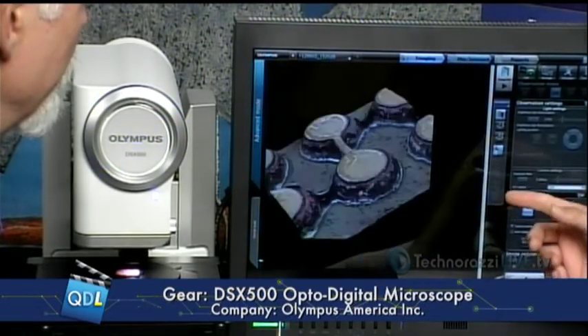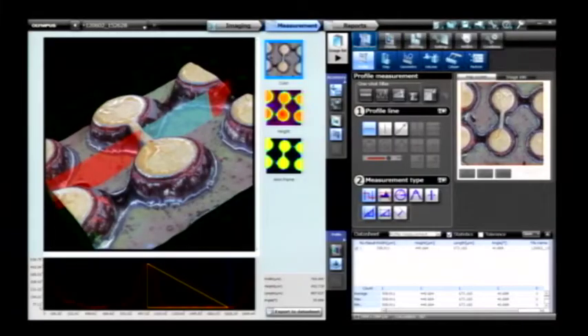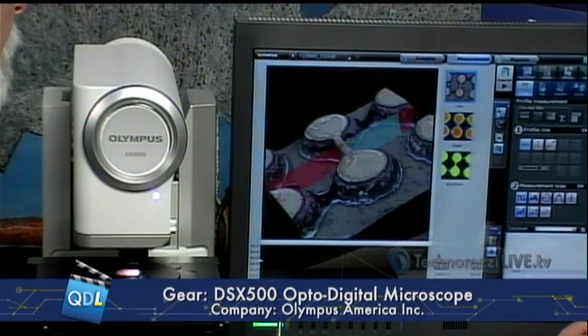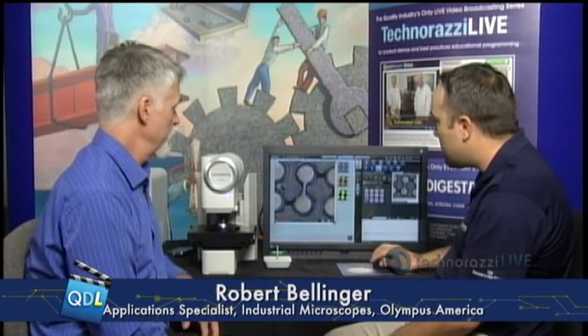We can switch to live measurements directly on a profile. For a cross-sectional profile, we can get height information and export that height data to a datasheet, which can be output to Excel. You can also do different measurement types: line width, angle measurements, curvatures, cross-sectional area, and since we have three dimensions, we can measure volume and surface area as well. For basic 2D measurements like on a normal compound microscope with a digital camera, we can do geometric measurements like center of circle — marking three points gives you a distance measurement between circle centers.